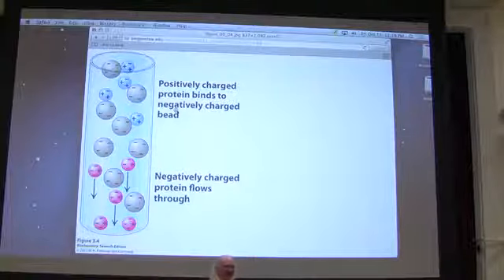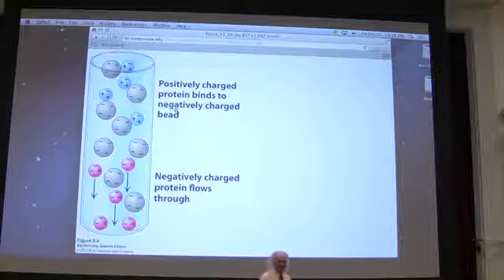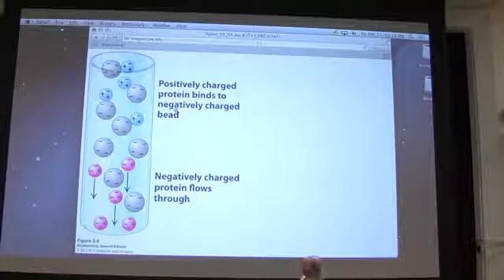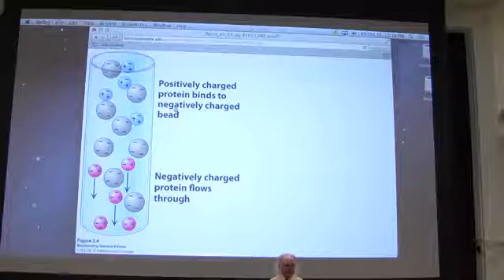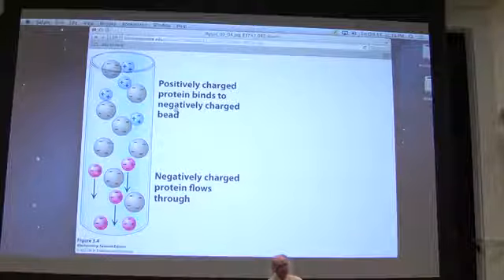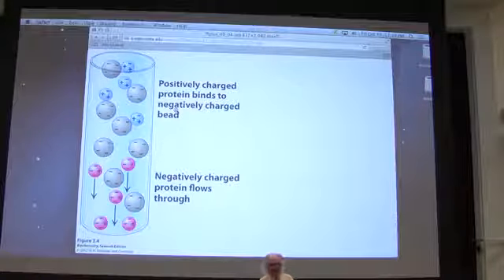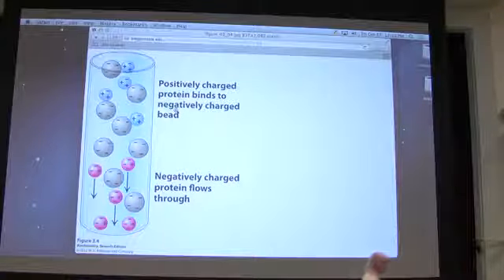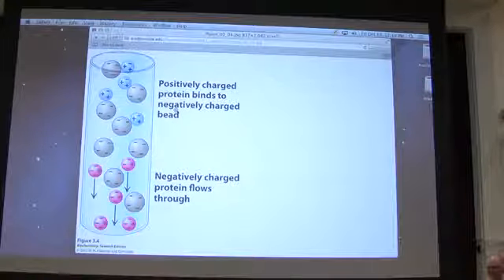Her question was, how come the proteins don't interact with the counter ions? I said, well, these proteins aren't going to interact with the counter ions because they're positively charged, and the counter ions themselves are positively charged, right? Where would we expect to see the counter ions? Attached to the negative proteins that are coming out down here. These won't have counter ions. They're going to stick to the beads. These guys down here are going to stick to the counter ions. Maybe I can think of a harder way to ask that question, so we'll have it on the exam. How's that?